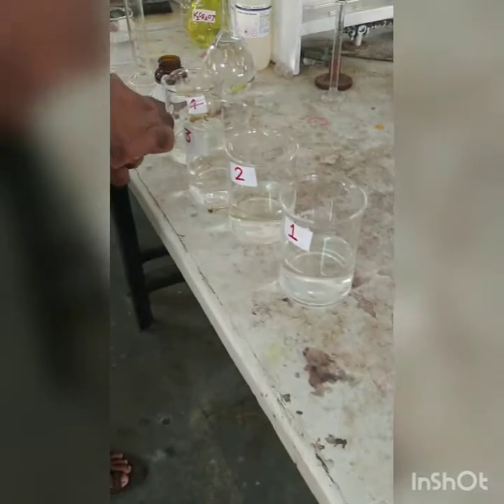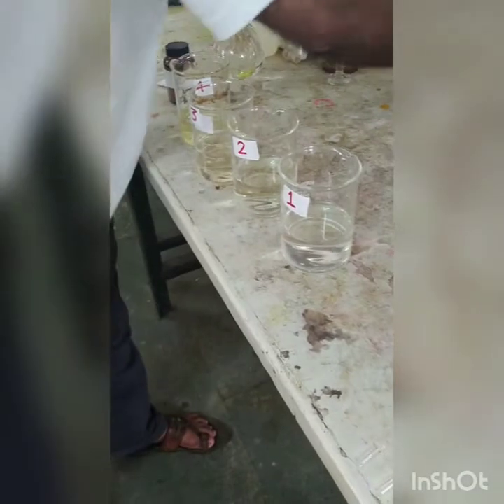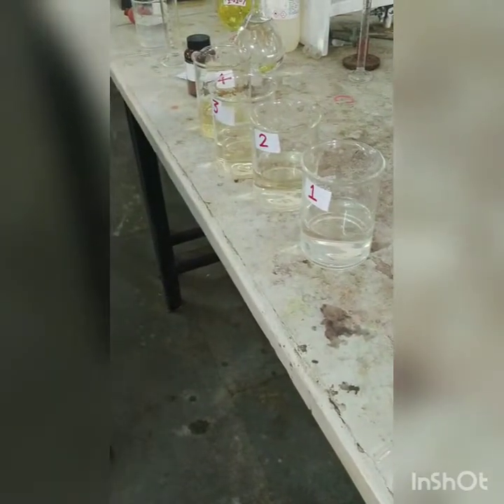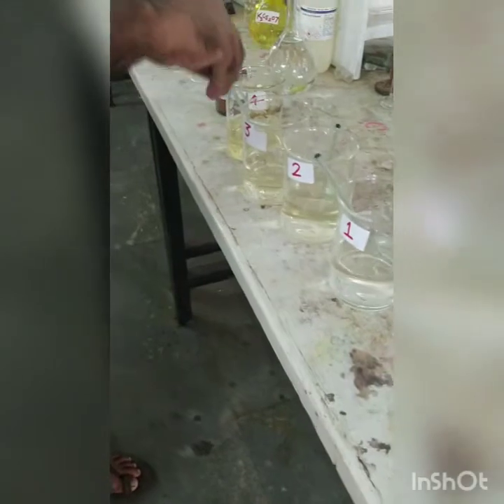We can feel a strong odor of acetic acid, like vinegar. Vinegar is like that only. So in hotels etc., the onion that we get which is dipped in vinegar, that kind of smell we have here in the lab, that is for acetic acid. So that the KI crystals will get dissolved.